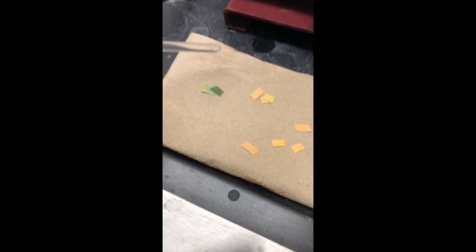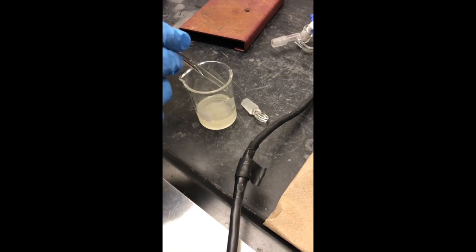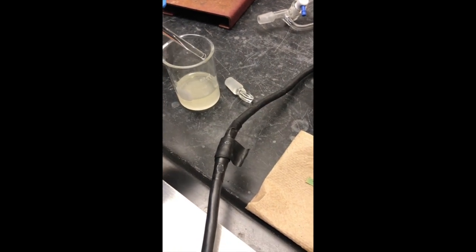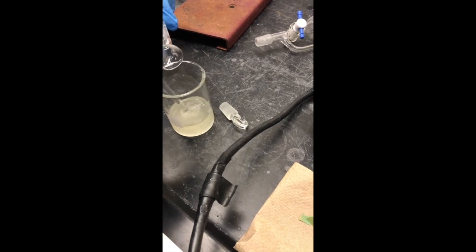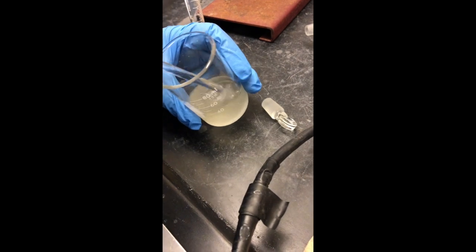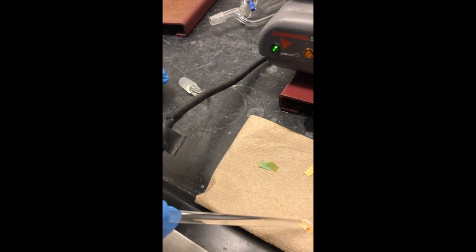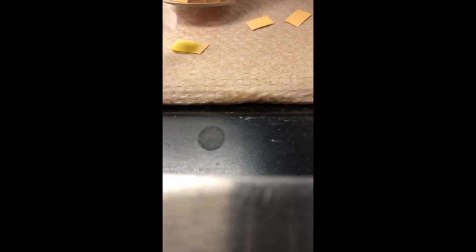The pH looks like around nine to ten. So we're going to proceed to add our HCl dropwise — about half a milliliter at a time — adding small portions so we don't overdo it. We test the pH after each addition, and it's now basically neutral; that moved pretty quickly.